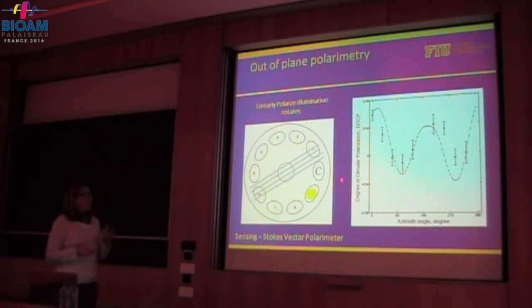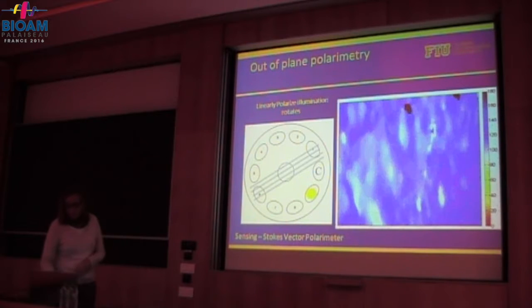But in terms of collagen arrangement, we realized that if you focus on parameters, for example, like the degree of circular polarization, you can find some very typical lobing, which then point to the dominant orientation of the anisotropic tissue. So ultimately, by doing this approach on an image, you can go pixel by pixel and reconstruct the dominant arrangement, these are angles, of that particular structure. And from there, you can calculate things like the degree of orientation or the preferential axis orientation.